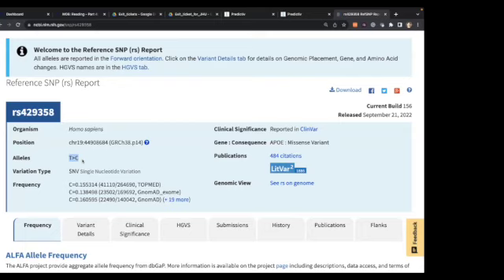So for those genes that belong to the reverse direction, you should be careful because this doesn't match. You have to change A to T, like a complementary base. Okay, and since T is replaced by C, this is a single nucleotide variation, SNV.